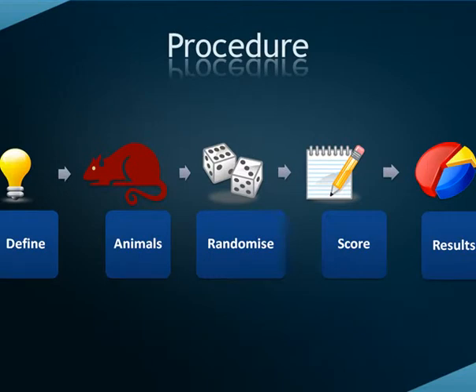The first steps are to define the experiment protocol and the treatment groups, and the next stage then is to bring the pool of animals that's available, and assign them to the treatment groups. We can then randomise the assignment and the treatment groups, and then make the scoring sheet available for the technician or the scientist who will actually capture the data. As the data is captured, then it is transformed, analysed and presented graphically and in a results table.